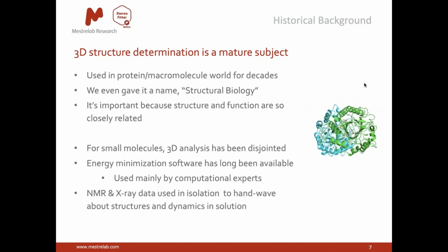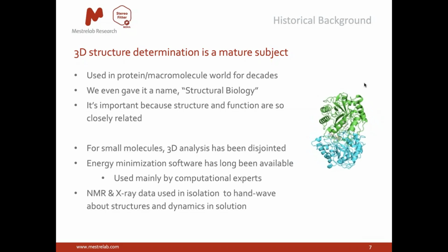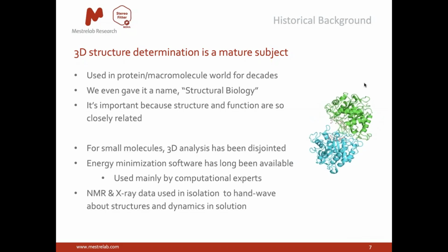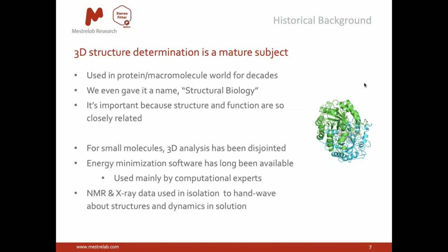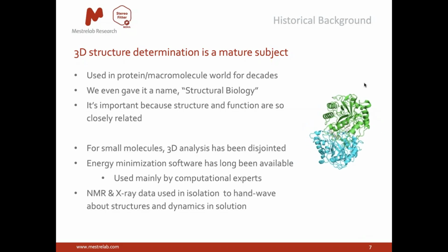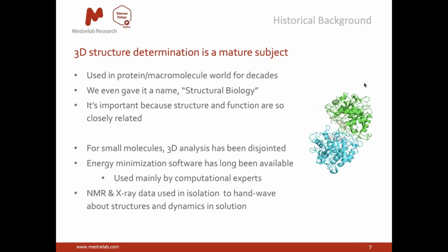In the small molecule arena, it has been more of a stop-start timeline. Molecular modeling software for small molecules has been around for just as long as it has been for proteins, but nothing really emerged that brought it all together under one roof when compared to, say, the CCPN initiative for biomolecules.